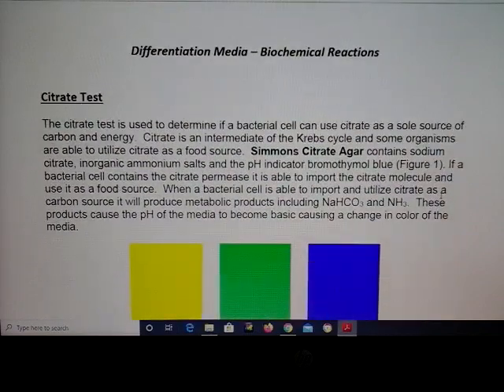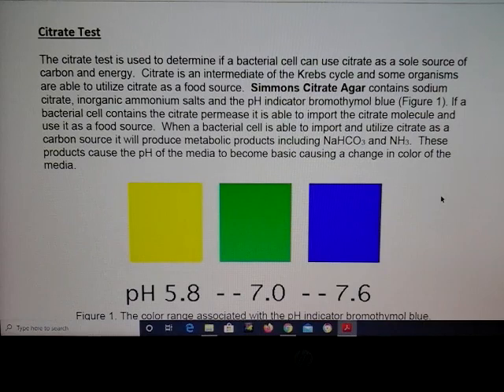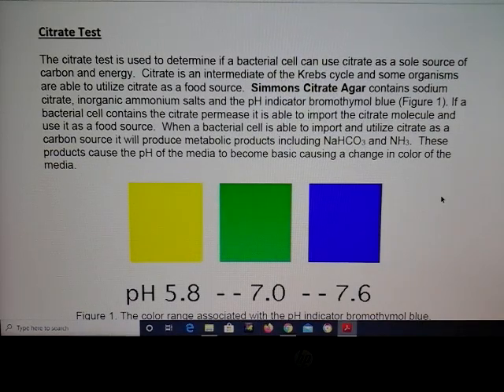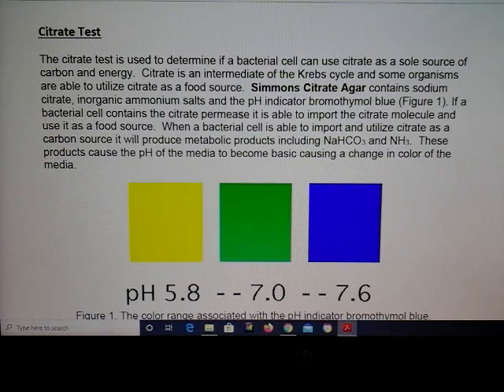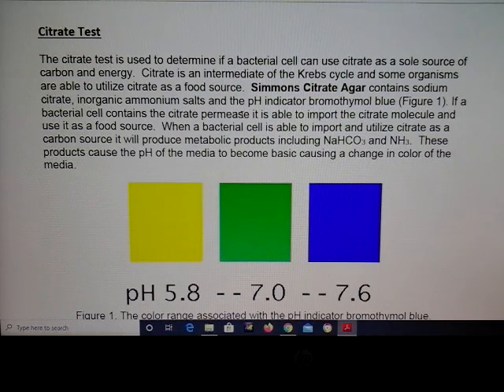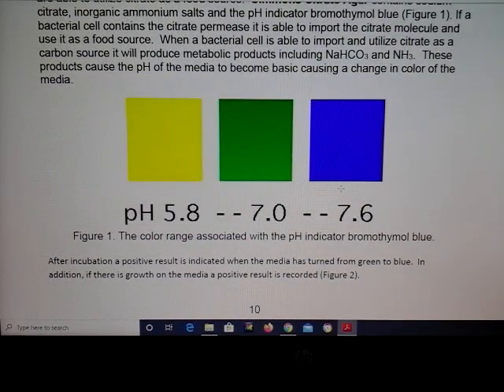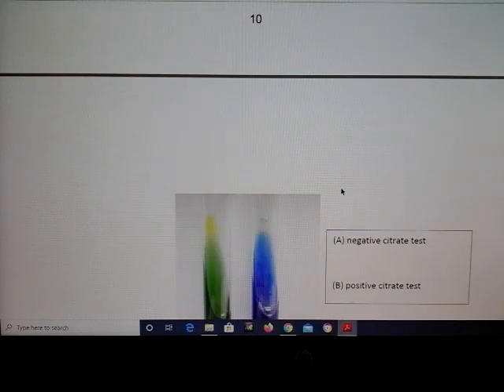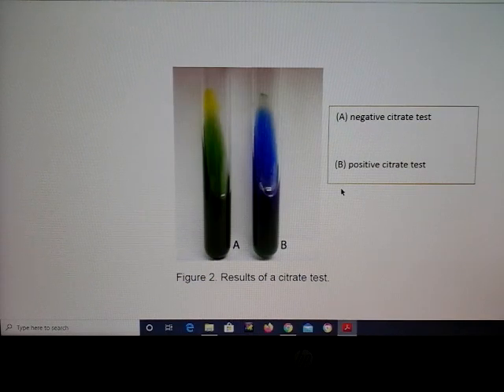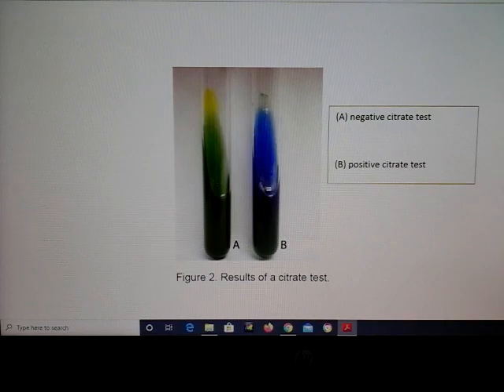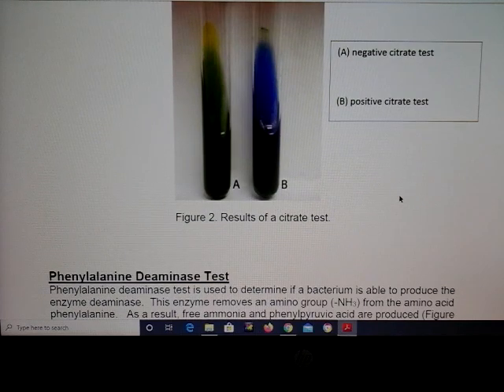The citrate test is used to determine whether or not citrate can be utilized as a carbon source. If it can, the bacteria produce citrate permease, which imports citrate into the cell. When you streak out a slant with your bacteria, if citrate is imported in, you shift the color from green to blue. Blue is your positive reaction.